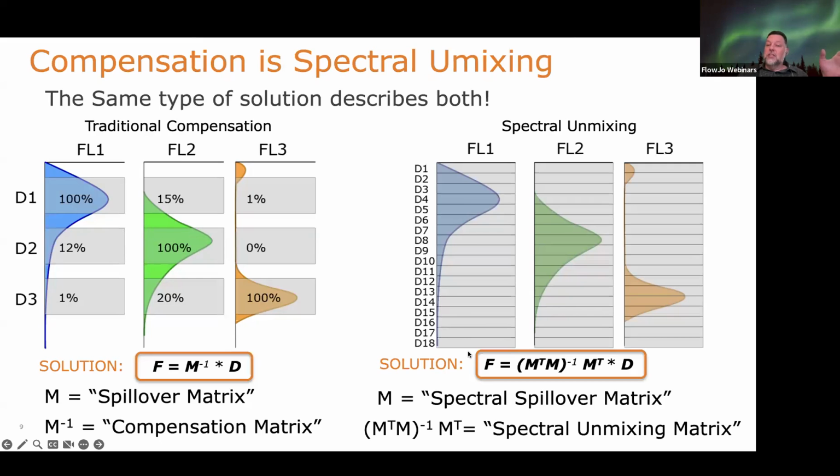And here on a spectral instrument, we have these filter sets basically side by side. There would be room for the laser lines, but you're trying to pick up as much of the spectrum as possible. And so the math becomes a little more complex, but ordinary least squares still is just basic compensation math, and we still have to solve for the same problem or get the same information, which are the spillover coefficients. That is how much fractional percentage of this peak emission gets picked up by all of the secondary detectors in the system.